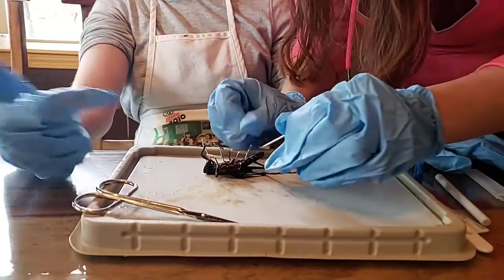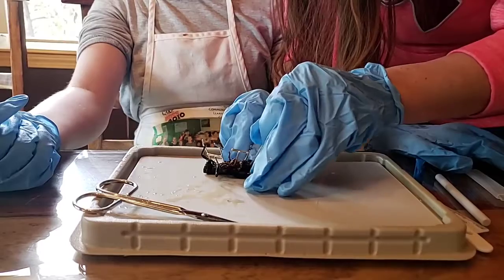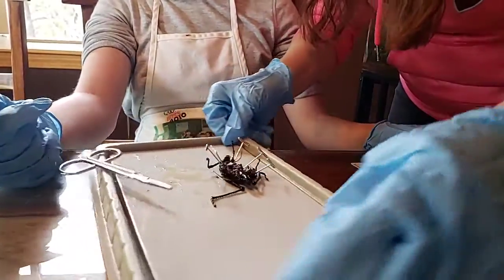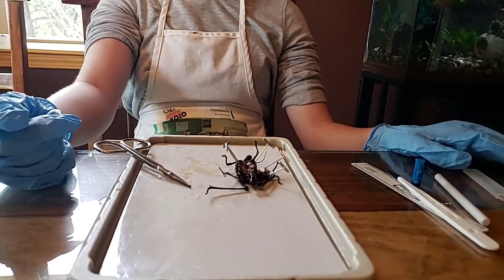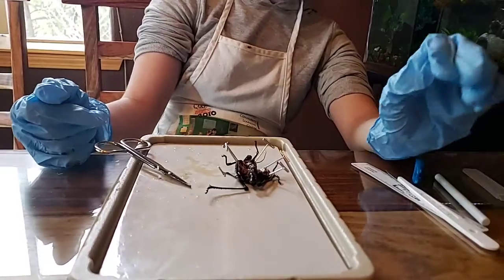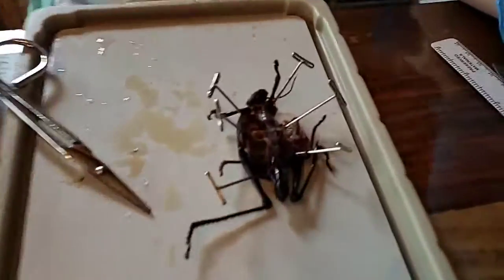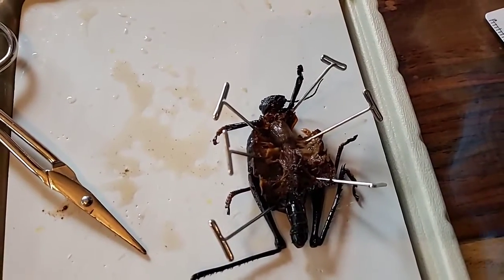His isn't preserved very well, so we're probably going to just work on Tanley's here because his is kind of poorly preserved. It looks like shredded beef. So, Mom, when I'm done with this, I'll be cameraman. Okay. So let's see if we can see that. All right, so we're going to get you a good view here. Yours looks like shredded beef. The insides of a grasshopper.